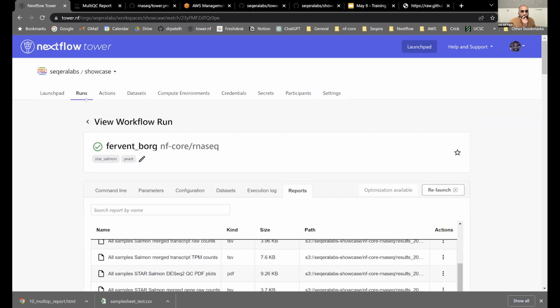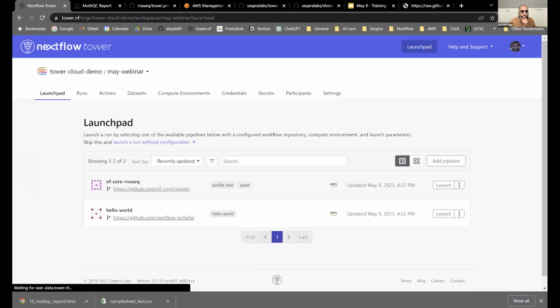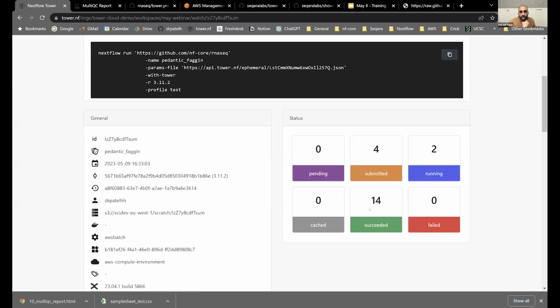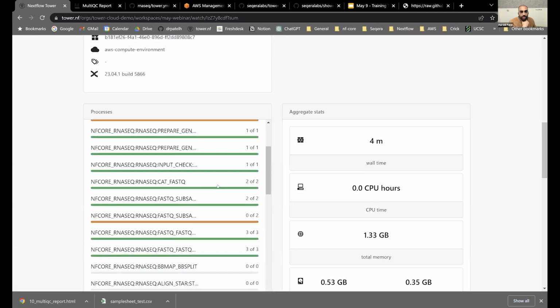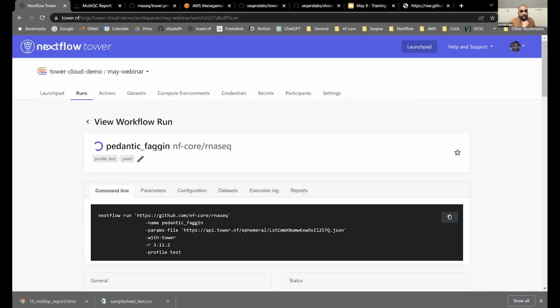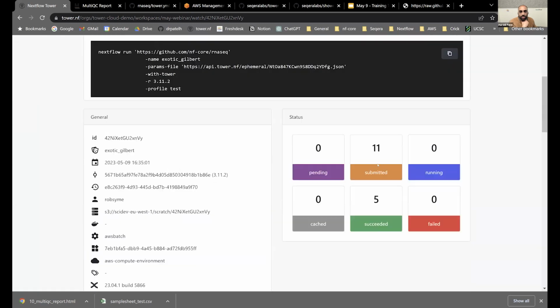Okay, so that's an example of that. Let's spin back to our newly created workspace. And here we go. So Rob's just triggered a pipeline now as well. The one that I triggered is now ripping through all the different tasks and should hopefully complete soon, at which point I'll have my reports at the end. And Rob's has just triggered off now as well.